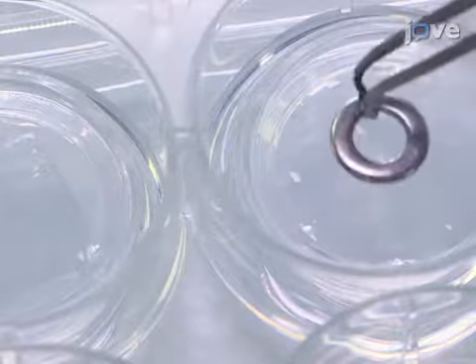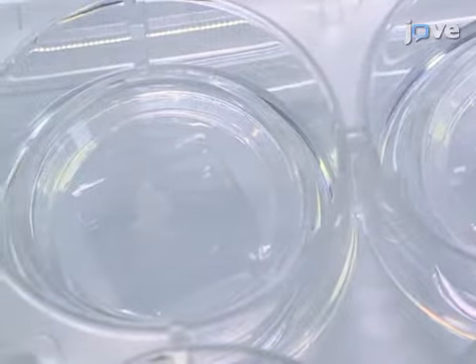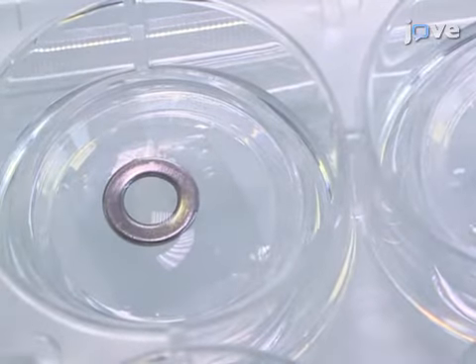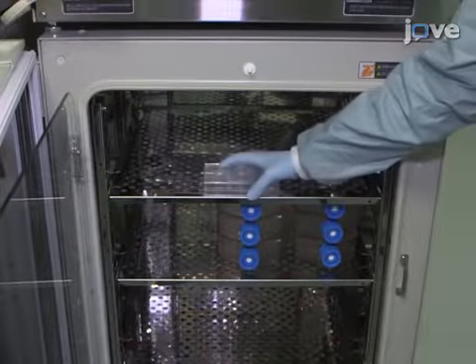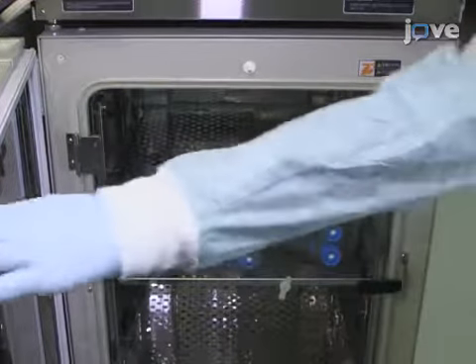Next, using fine forceps, place pre-sterilized and pre-wet stainless steel washers on each slice. Make sure that the washers are well positioned on the agarose surrounding the tumor tissue. Leave the plate at 37 degrees Celsius for 10 minutes in a humidified 5% carbon dioxide incubator prior to immunostaining.